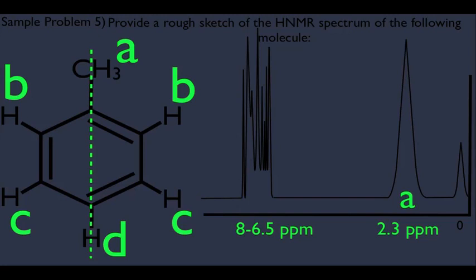Now let's go back to those benzene ring hydrogens. Why do they peak around 6.5 to 8? And think about that. That's very shifted. Remember, usually the chart goes from 0 to 10, so they're really technically very far downfield. Let's understand why they're so shifted. But before we do that, we have to go back to a basic concept that you might have learned in physics. And that's basically this.